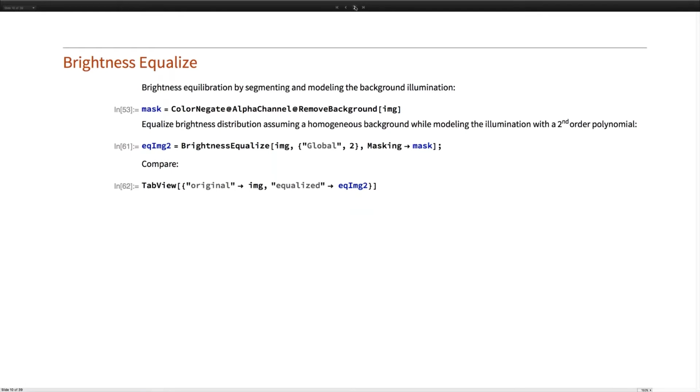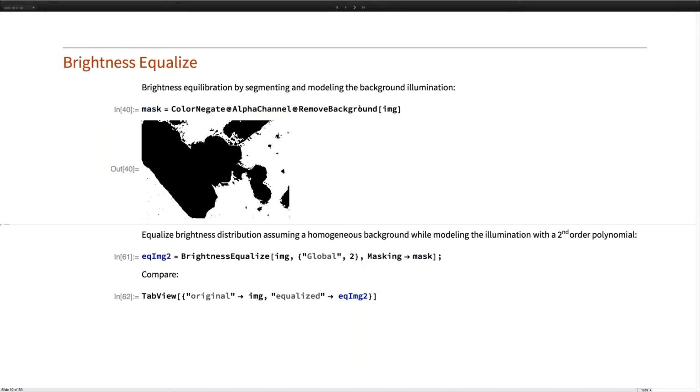It very often occurs that you do not have a chance later on to obtain a flat field directly at your microscope because the conditions may have changed. You may not have taken the images yourself. So quite often you are doomed to generate your flat field a posteriori, and that means basically taking the image with the specimen in it already and trying to derive a flat field image.